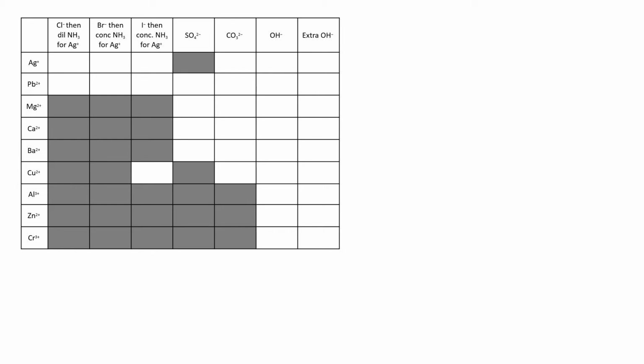Okay, so here's where we're going to go through the inorganic stuff. You might remember you got presented with this chart on the data sheet, just a whole bunch of different solutions that you were going to go mix together. So I did this, and actually I did this several times, and with the help of various of my students and my son, we took some pictures of things. So let's quickly go through it and explain what's going on, hopefully in a way that will help you.